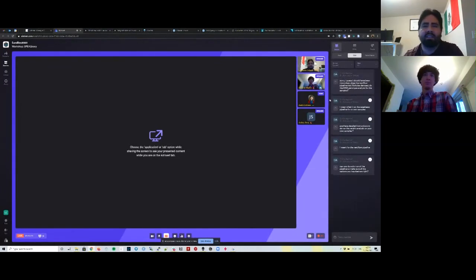No, SPEAQeasy does not do the DNA genotyping analysis. You have DNA genotyping by yourself, internally in our institute. Josh Stolz has written some code for processing the DNA genotyping with the TopMed imputation panel using the Michigan server, I think.